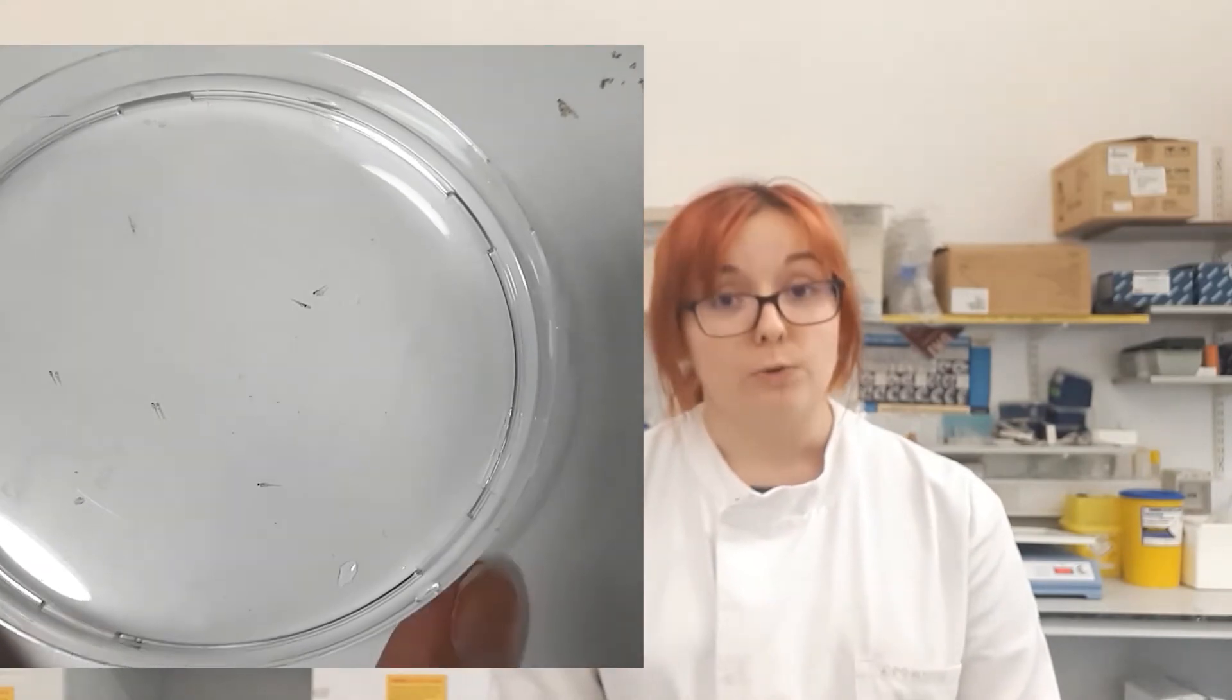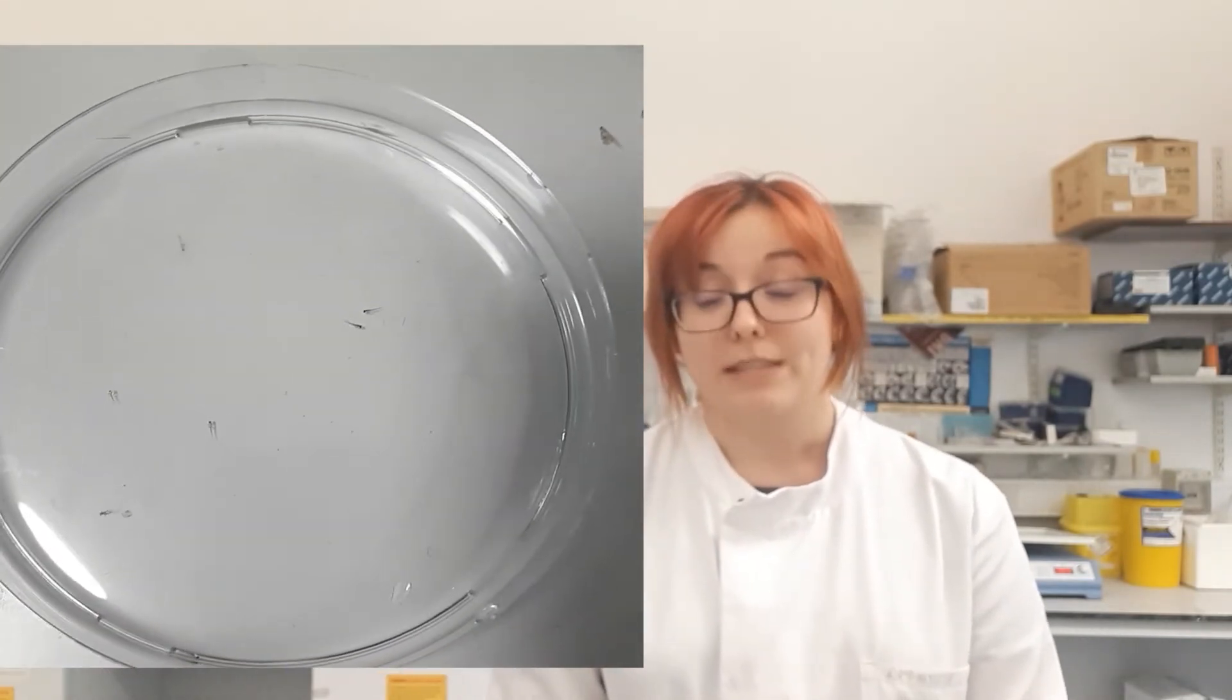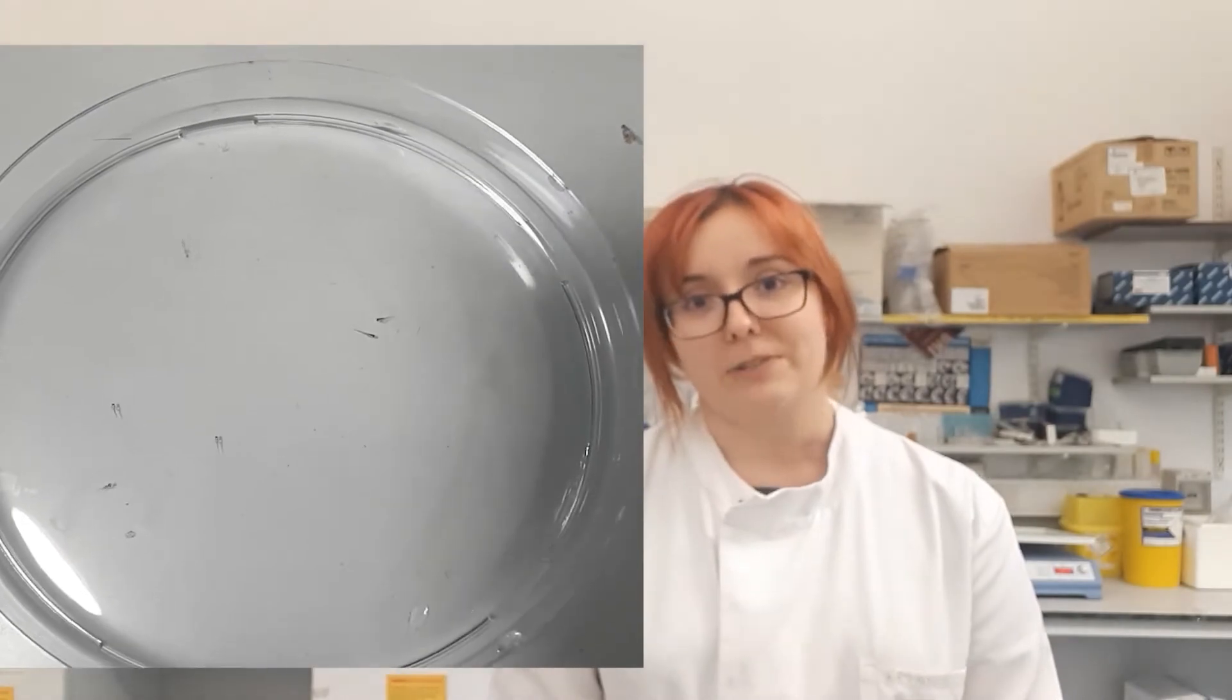And these baby fish are so small that it's difficult to see them without a microscope. So let's have a look at a baby fish under a microscope.